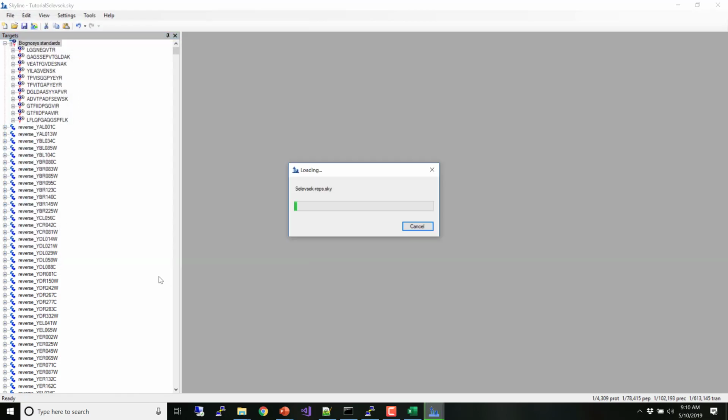The beautiful thing about the Selevsek experiment is they actually did 2 experiments. They did this osmotic shock thing where they're expecting proteins to change. And then they did these replicates where they were just trying to prove that they could measure things stably with low CVs. And on reading and exploring the manuscript, I think there's a little bit of smoke and mirrors in that they report 4 replicates for that experiment, but they actually collected 8. And when I asked them, why did you report your CVs with only 4 replicates? The answer was, well, that's fairly typical in the field.